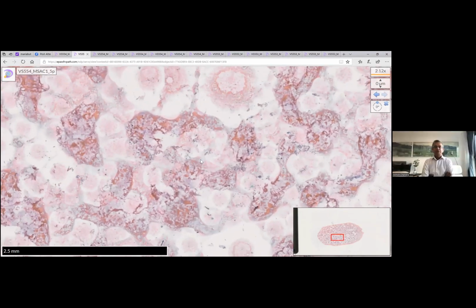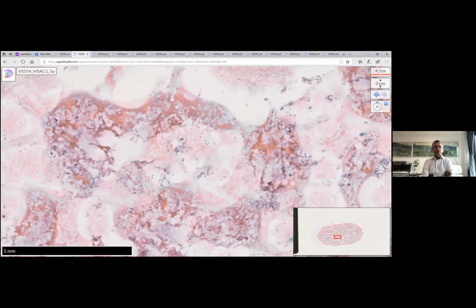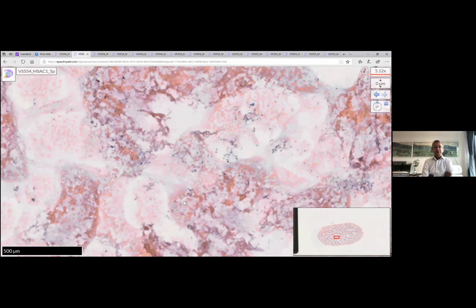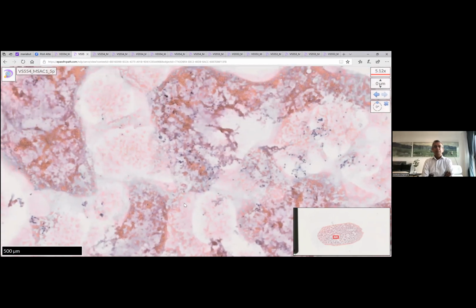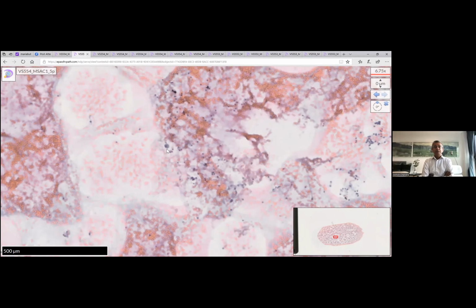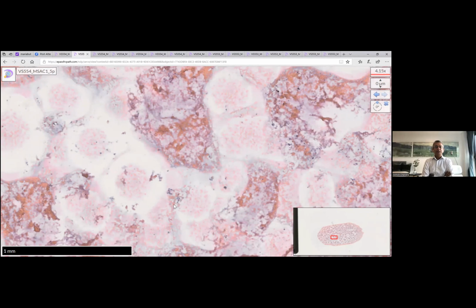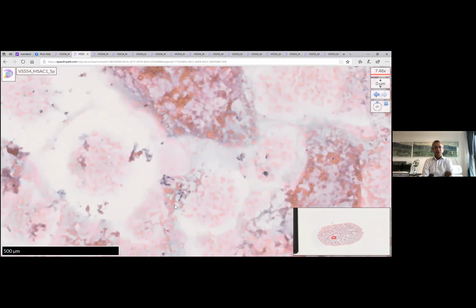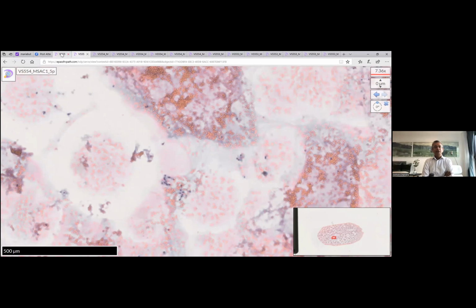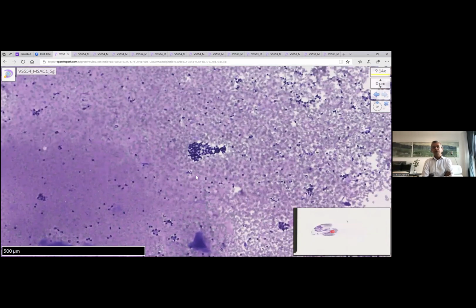So in the context of a one-stop clinic, of course, with only the Giemsa, you would be able to say it's an adequate smear with colloid and cells. And in the clinics where our BMS or cytotechnologists attend the FNA list with the radiologists, they're able to assess these slides and guide them as to whether further passes are necessary or not.